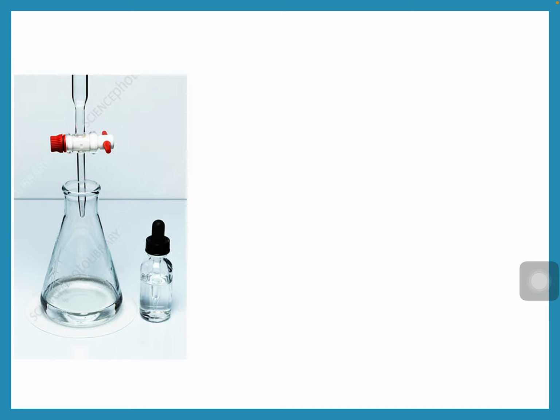So this is what the setup looks like. Those of you who were in person saw the burette, and this is where we put our known concentration. Our titrant comes in here, and through the lab we will measure the volume of the titrant that gets used to titrate the analyte. This is a specific volume that we choose, and we don't know the concentration of this.